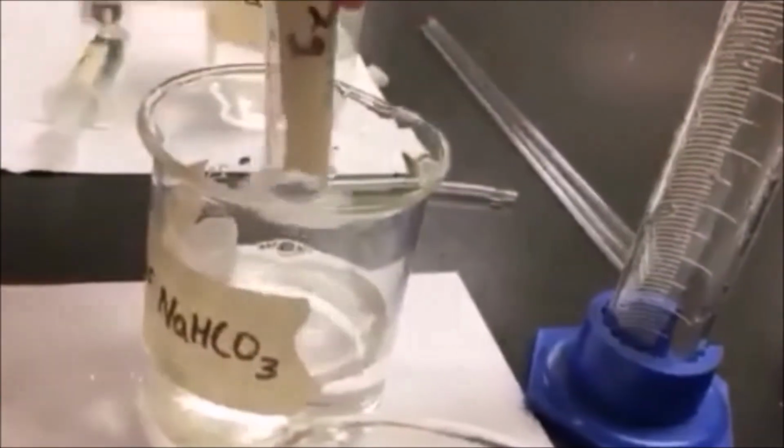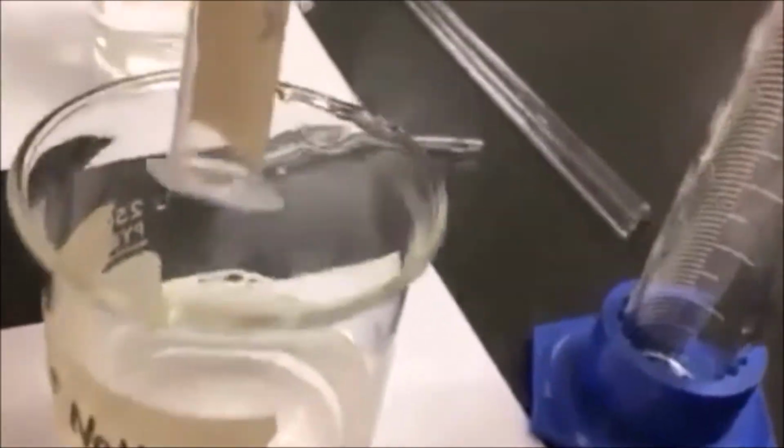Create a vacuum by completely covering the tip of the syringe with your finger. Draw back the plunger for 30 seconds. Release the vacuum so the leaves can be submerged into the solution. Repeat this 2 to 3 times until all leaves are submerged in the solution. Once the leaves have sunk in the solution, remove the stopper and quickly empty the syringe back into the sodium bicarbonate solution. This is to avoid the leaves having contact with the air.